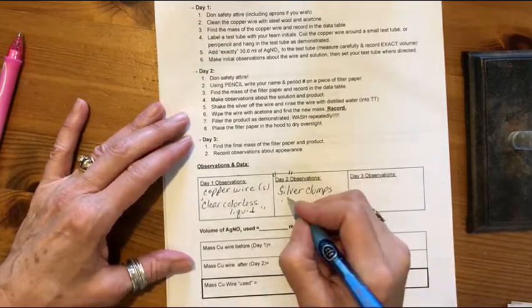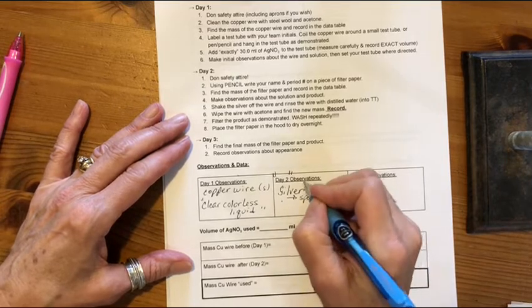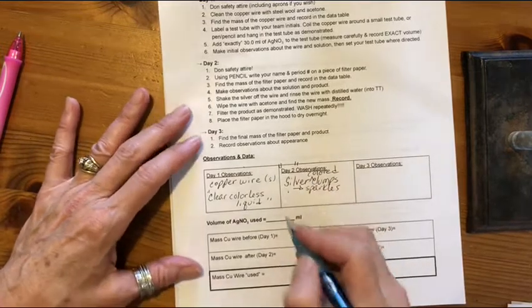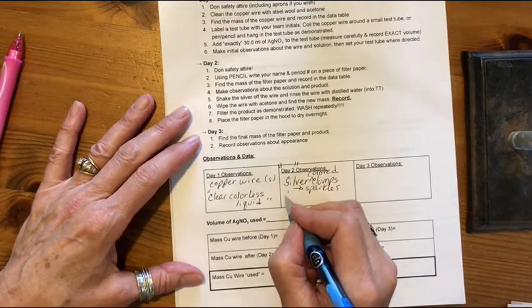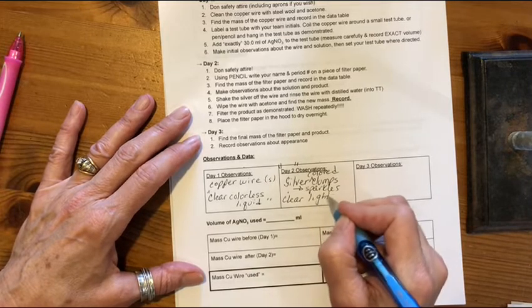And you can actually see some sparkles on it. So silver colored, we have to be careful because we didn't test it. It was really silver, but it is. And then now the liquid is clear, but it's not colorless anymore. It's a light blue color.